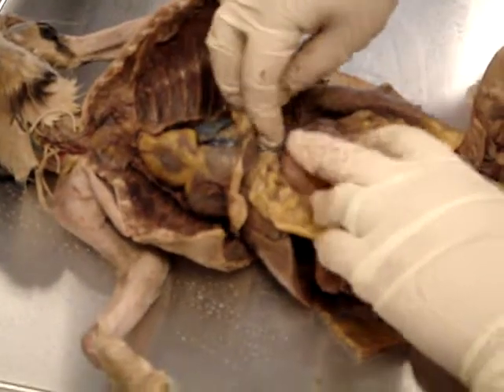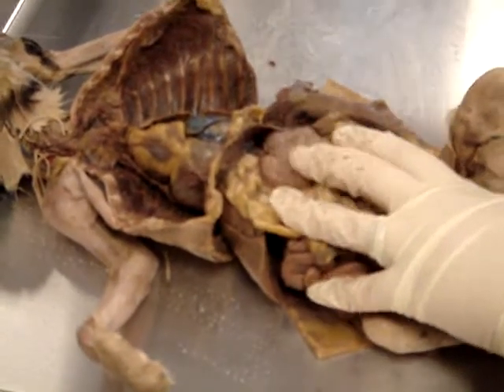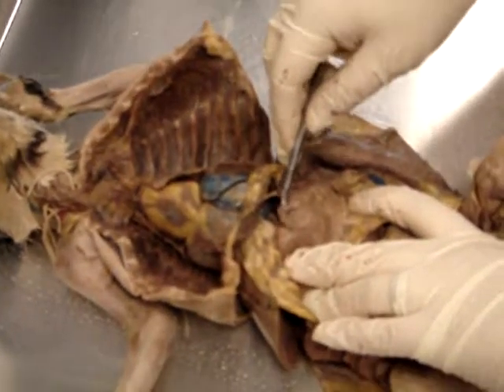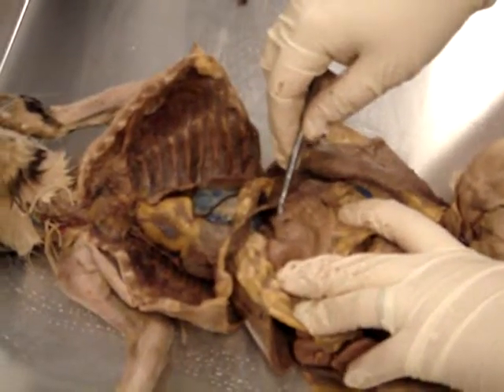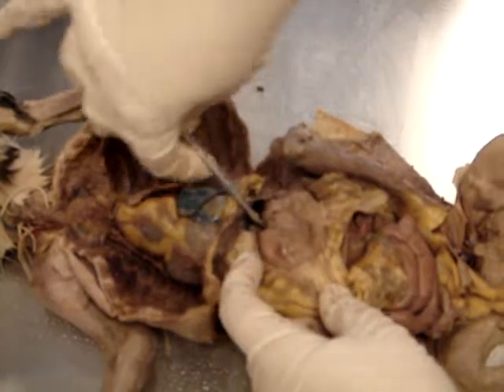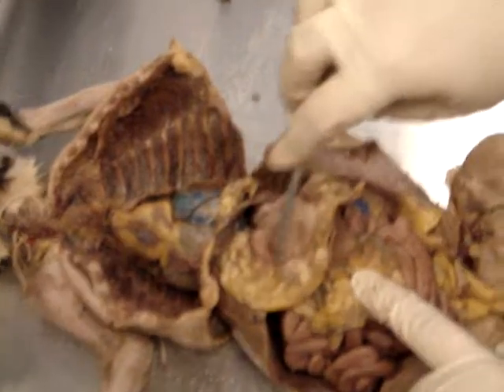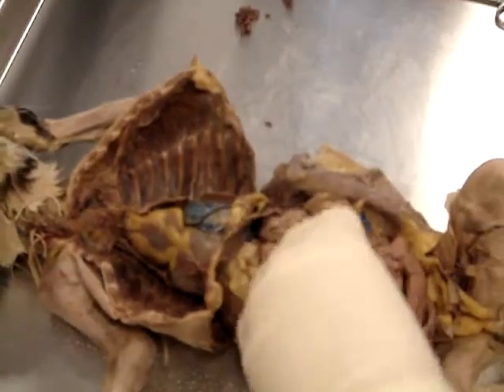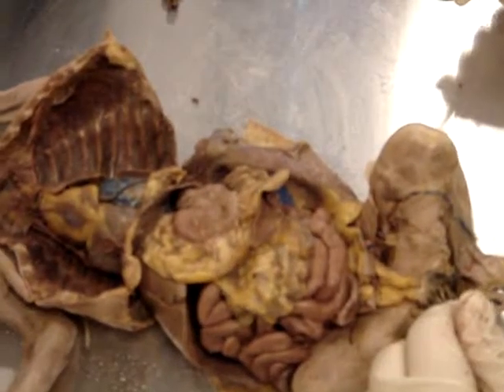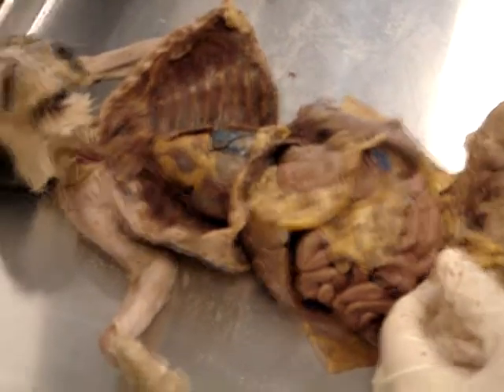Okay? And then along the inner curvature, can I have a probe? Thank you. Along the inner curvature, it's kind of covered with blood, so you can't see it very well on this cat, but you see this little thing right here? That's the lesser omentum on the lesser curvature. It's just on the inside curve, as opposed to the outside curve. So this is the greater curvature of the stomach. This is the lesser curvature. And so this is the greater omentum, and this is the lesser omentum. The greater is connected to the greater? Yeah. And the lesser to the lesser? Yes. That's good how that works out, huh?